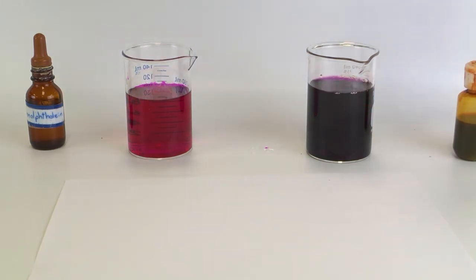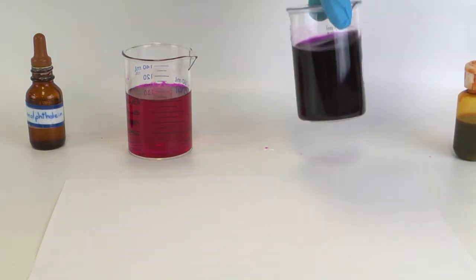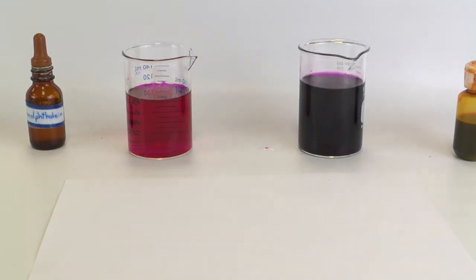It goes to purple. I'm not sure if you can see it, but it's actually a purpley shade there. So those are the things that acids and bases do. Had I added that nice and slow, you would have had a nice gradient change that would go from orange to yellow to green when it was neutral, back to blue and then violet.